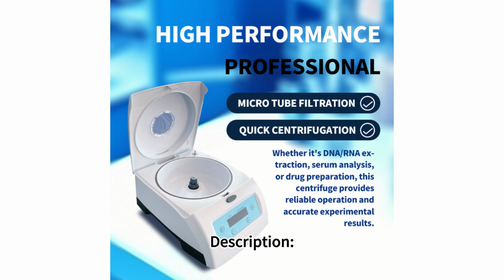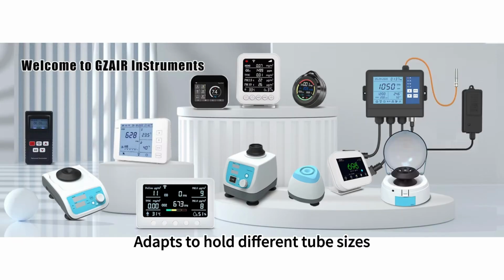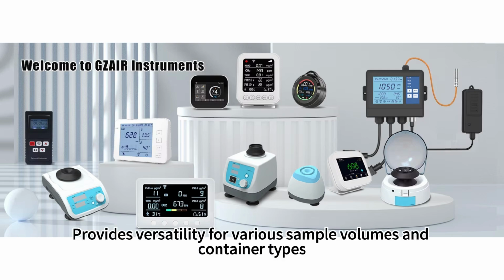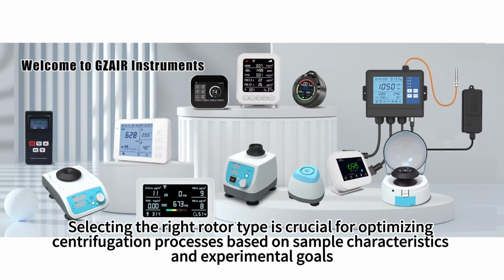Adapter rotor. Description: adapts to hold different tube sizes. Use provides versatility for various sample volumes and container types. Selecting the right rotor type is crucial for optimizing centrifugation processes based on sample characteristics and experimental goals.